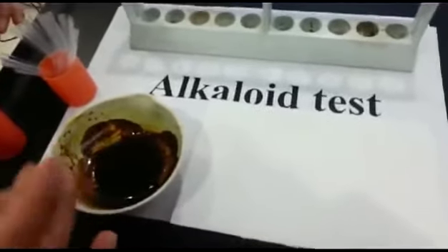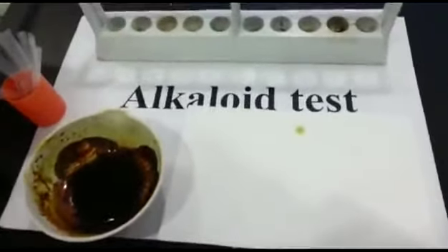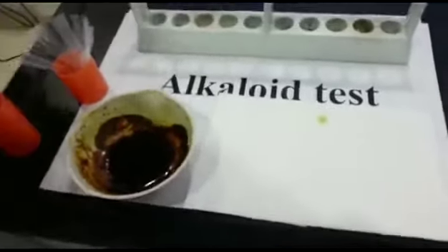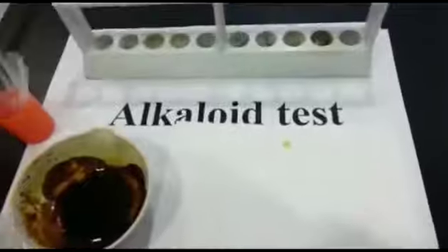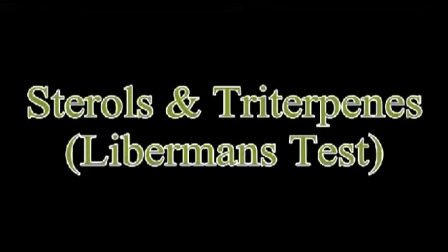First of all, for the alkaloid test with a capillary tube, we are taking the sample in the form of a drop onto the filter paper, and another sample for the standard that contains alkaloids. Then we are going to spray the filter paper with Dragendorff spray. The downward side sample was the positive sample.